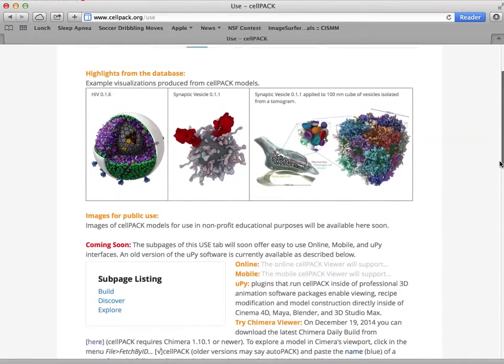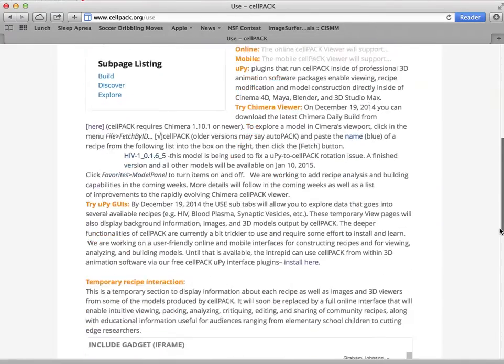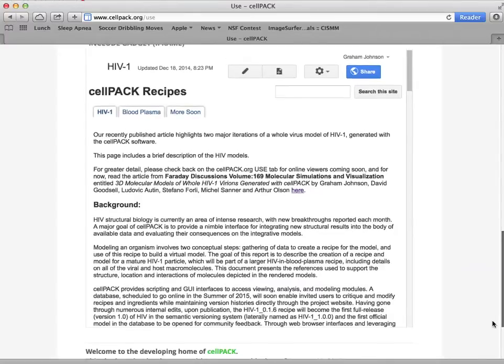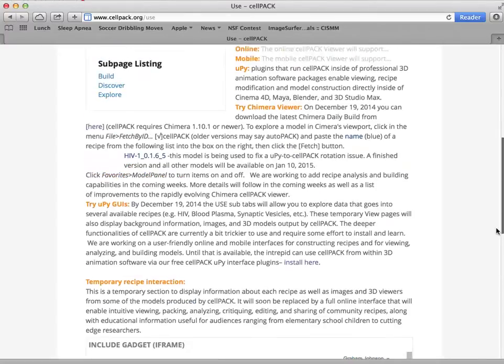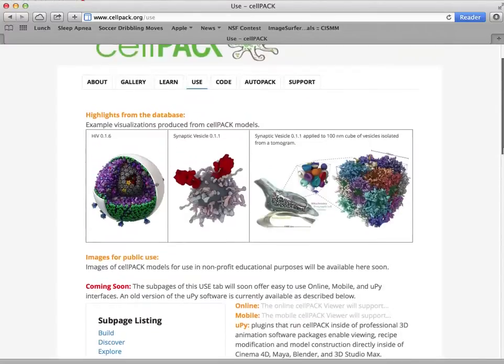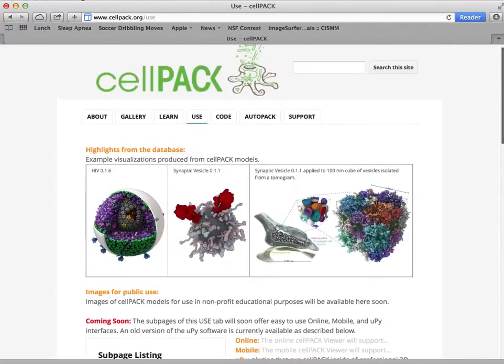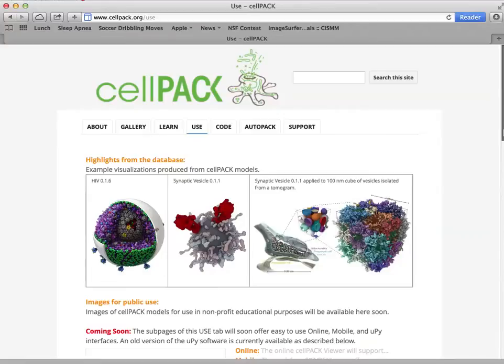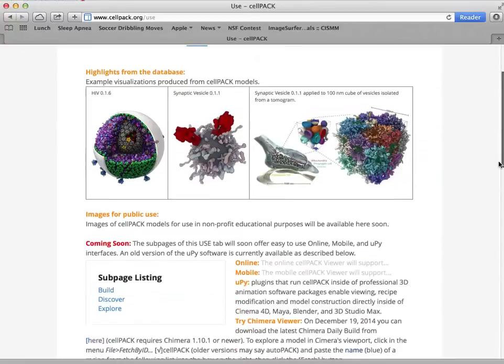So in the near future, we're going to have a lot more detail here on the Cellpack website as well as an interactive viewer that will enable you to view models, modify existing models, create new packings, post them to the database, etc.